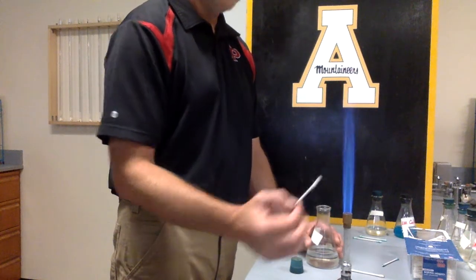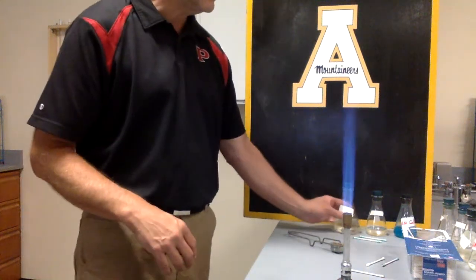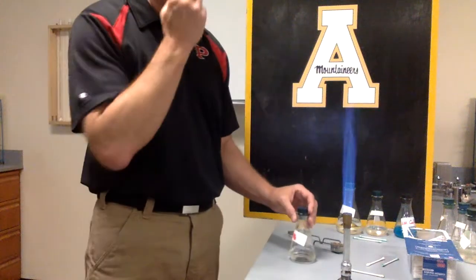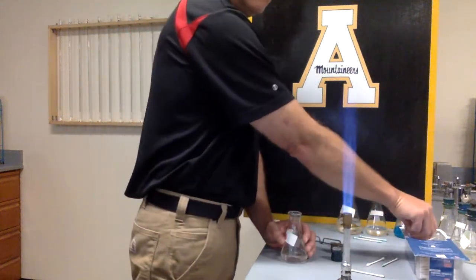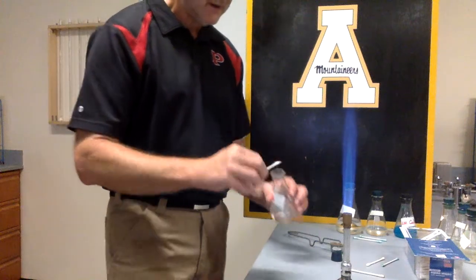One of the things that I want you to realize is sometimes you'll get these yellows in your color changes. Like that one was kind of a fleshy color, but every now and then you'd get a yellow. If it looks like the color of paper burning, then I'm probably burning the Q-tip. So let's keep going.